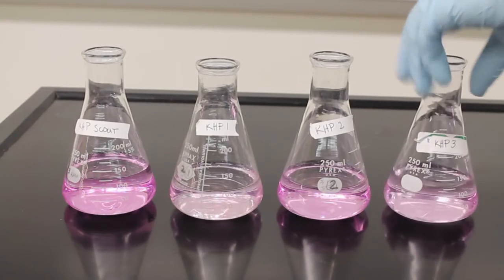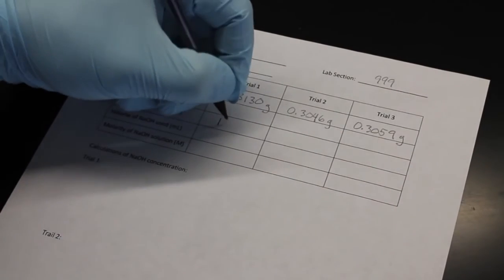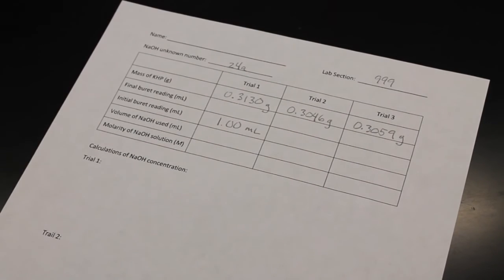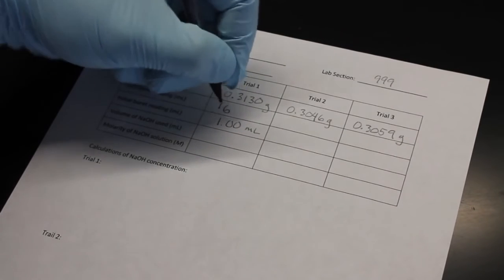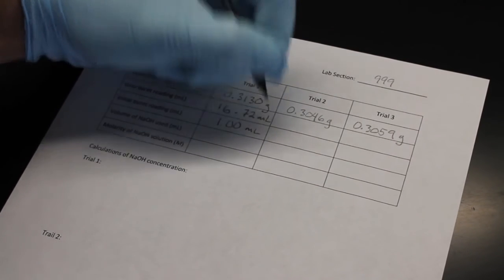Don't forget to document your initial and final burette readings. The burette I was using had marks for every 1/10 of a milliliter. We can tell if our volume falls between these marks, so we need to document our volumes to the nearest 100th position. This is the proper number of significant figures for this piece of glassware.